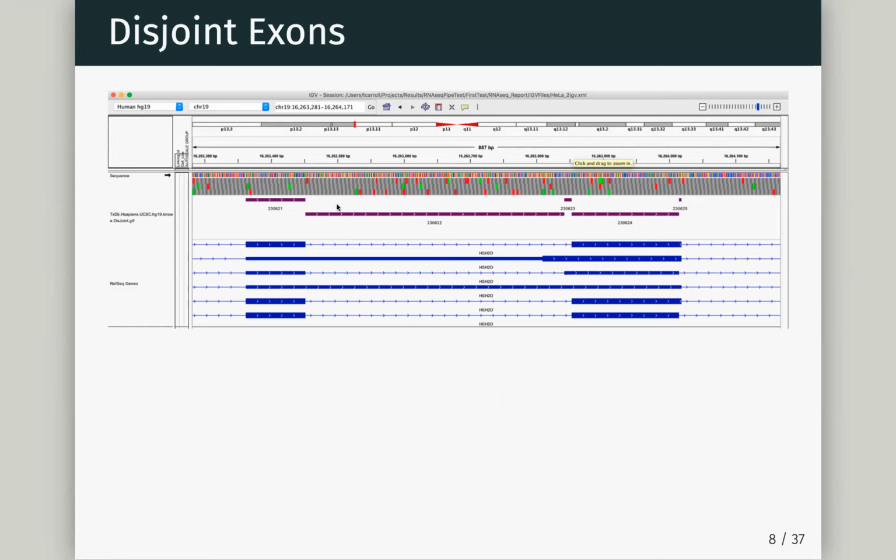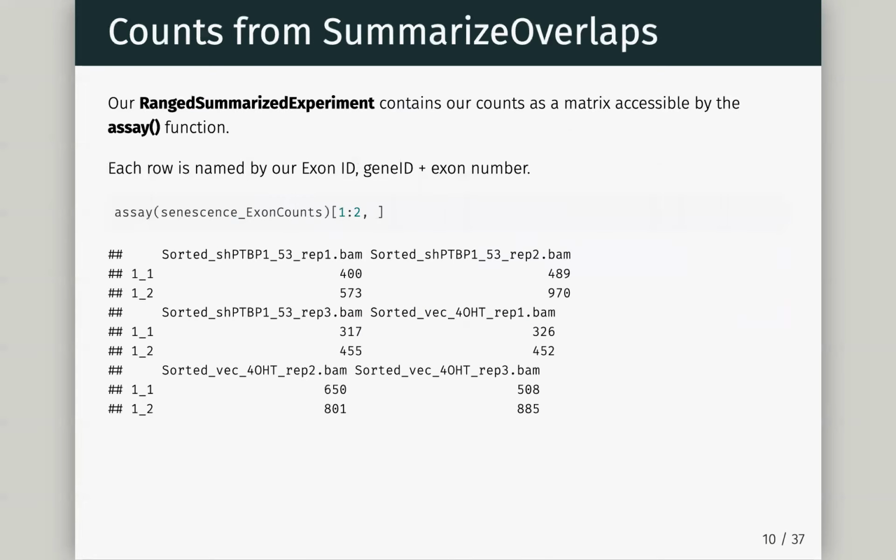I wouldn't expect a read to go from one gene to another and still believe it. But in this case, I could very much have a read which covers a little bit of this exon and a little bit of this exon. Right? So I don't want to throw them away. And we're going to assign them to both exons. It's just what we have.